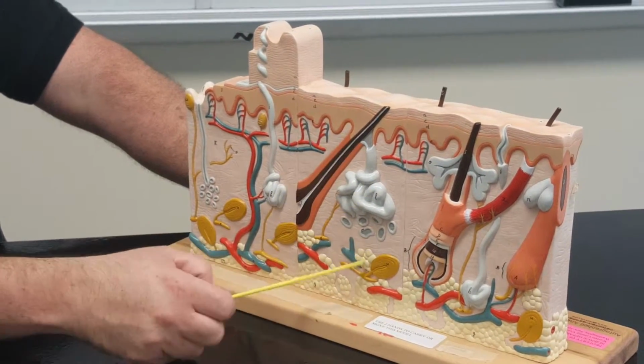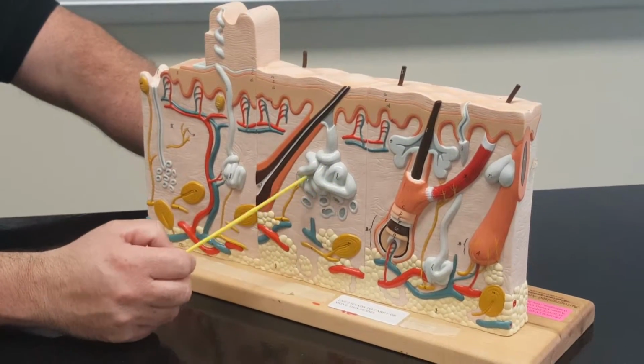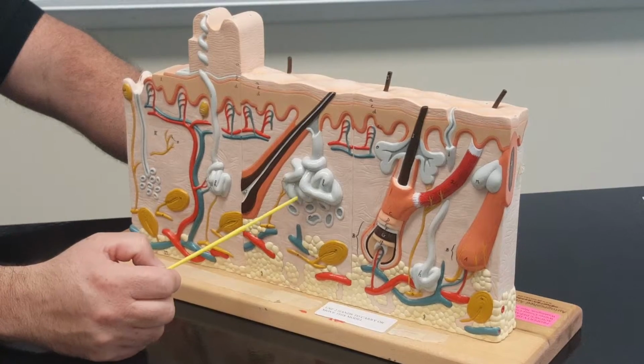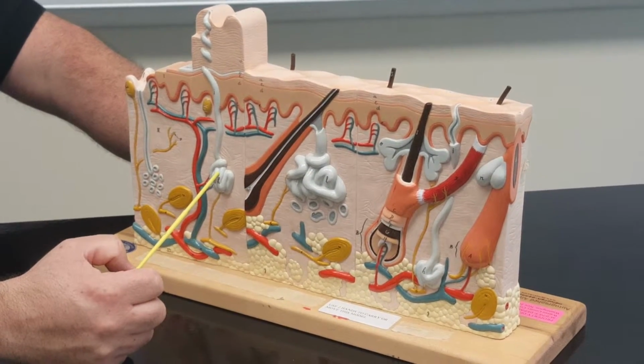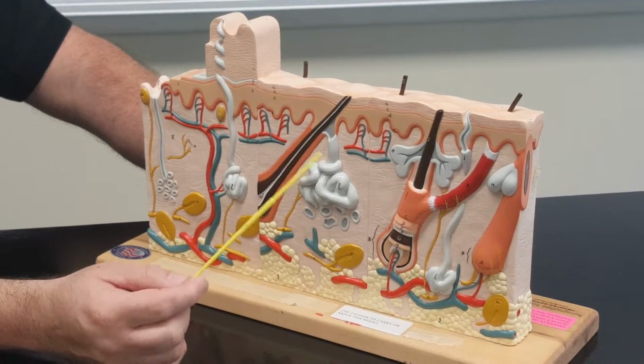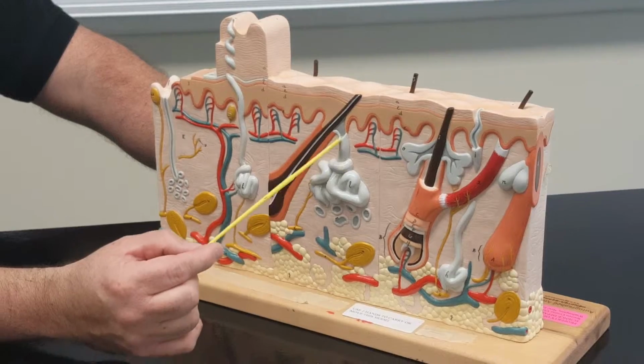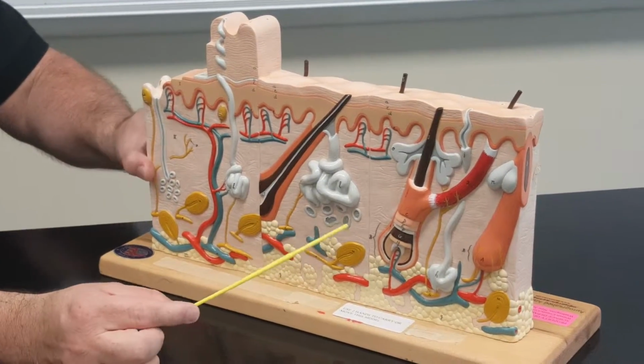Here in the axilla, in the armpit region, we have apocrine sweat glands. They are active during puberty, okay, larger than the merocrine, aka eccrine sweat glands. Apocrine sweat gland, see how it's attached to a hair root, okay? So here we have the duct. Okay.